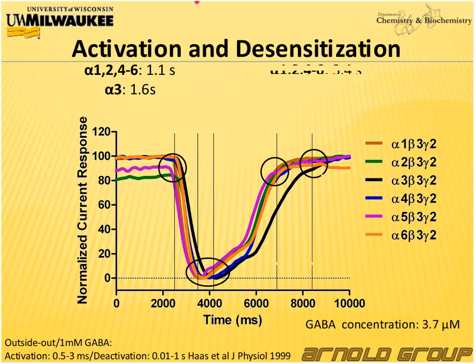And the same trend we can find for the desensitization, where the alpha 3 containing GABA-A receptor takes longer to desensitize. So we can make a relative comment on how the activation and desensitization occurs within the GABA-A receptor having different alpha subunits.